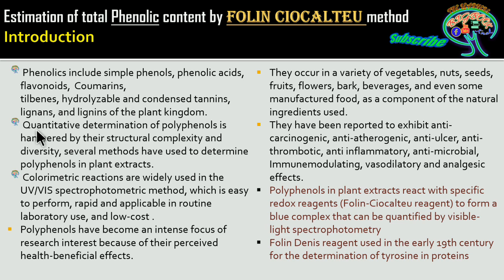The quantitative determination of polyphenols is hampered by their structural complexity and diversity. Several methods have been used to determine polyphenols in plant extracts. With the help of a reducing reagent or any other form of reaction, there are different forms of studies to study these antioxidant phenols.